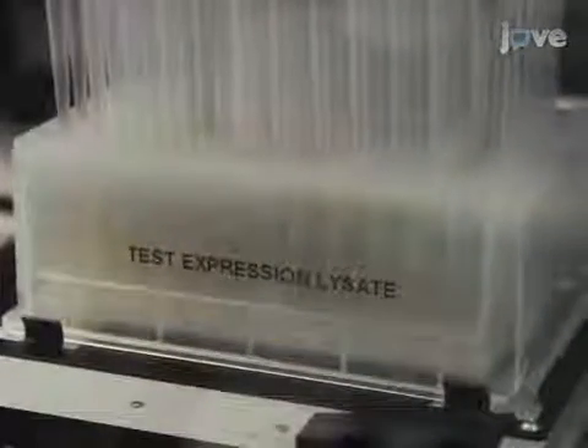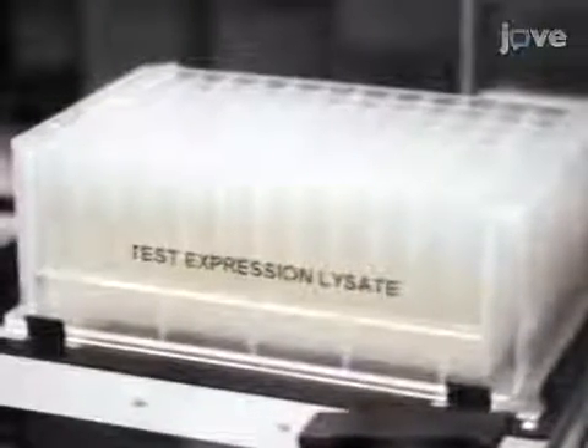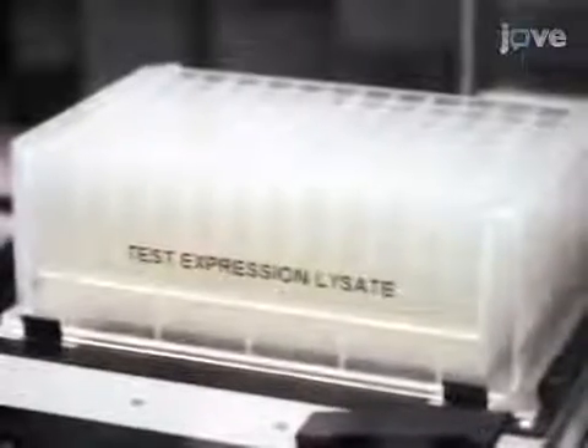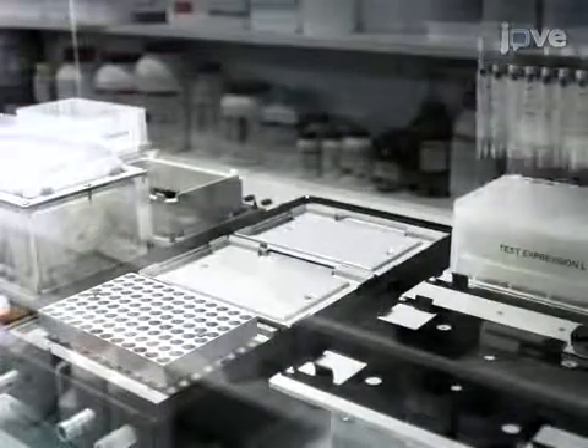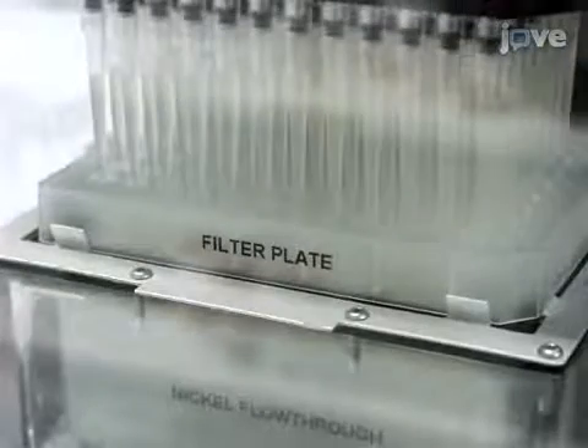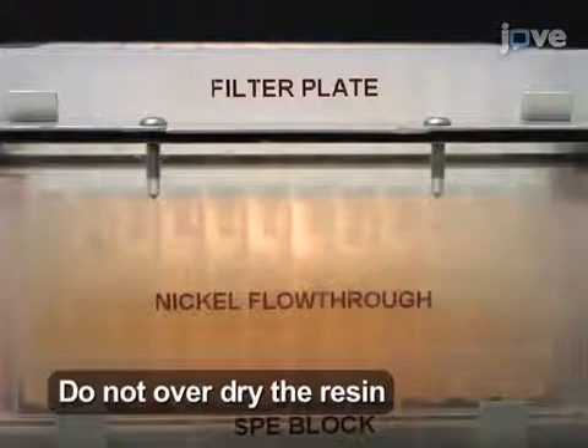To avoid clogging of the filter plate during the purification, it is critical to carefully visually check that none of the lysates are viscous anymore. On the liquid handling robot, use 200 µL wide bore tips to thoroughly mix the resin slurry before transferring 200 µL of the slurry into the deep well 96 plate containing the lysate. Shake the deep well 96 plate at 1400 RPM at room temperature for 10 minutes to allow binding, then use the wide bore tips to mix and transfer the full 1200 µL of resin-lysate slurry in 200 µL aliquots onto the filter plate. Turn on the vacuum for approximately 30 seconds to filter the lysate through the plate, collecting the flow-through in a deep well 96 below.